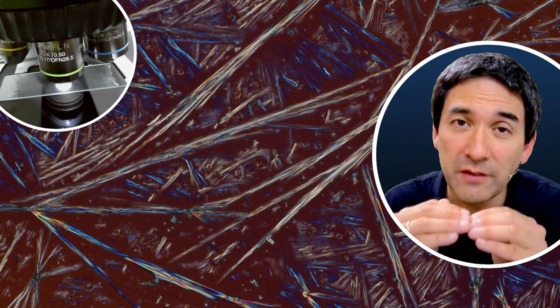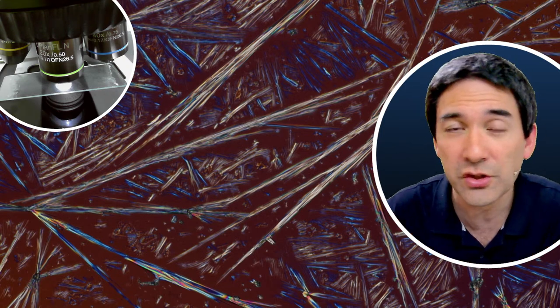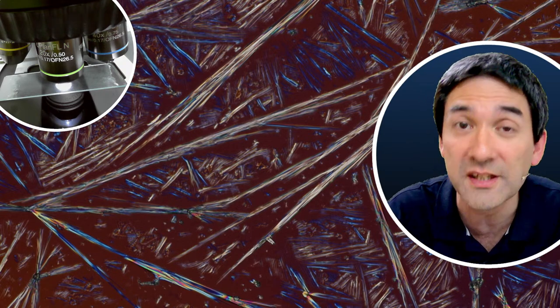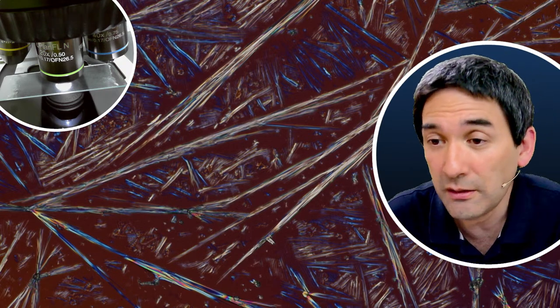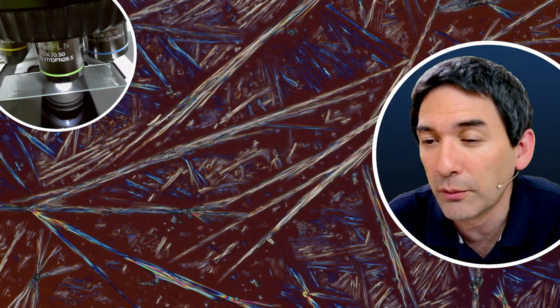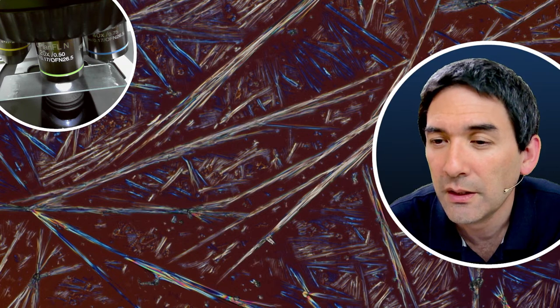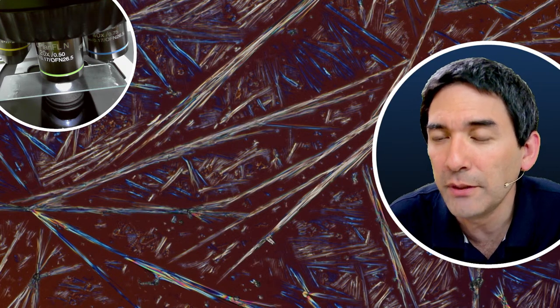And sometimes the very thin crystals, they look nicer. So you see that, not only the solvent, but maybe also the amount of the substance also has an effect. So I would say the answer is clearly yes, but it depends also on the substance that you're using.